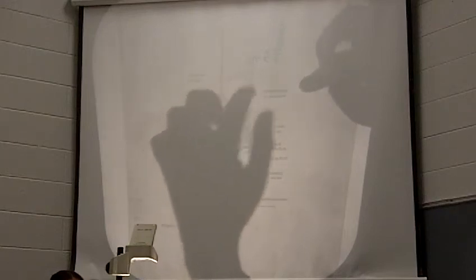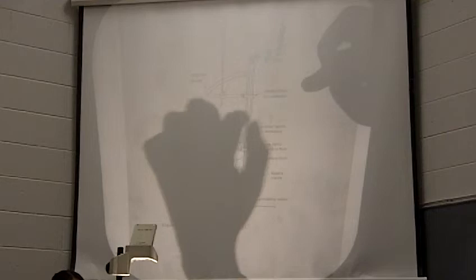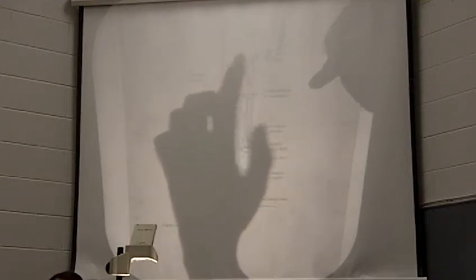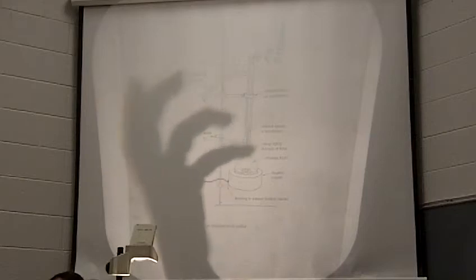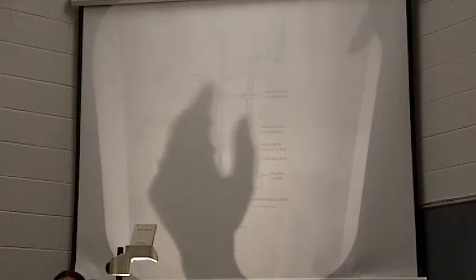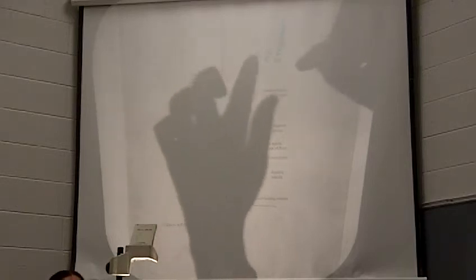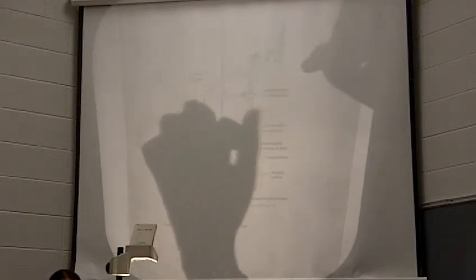Then we're going to put our condenser on top here. And usually you want to use your Liebig condenser because you've got the best cooling with that. It's got the biggest jacket on it. So you're going to have the most water circulating through. You're going to have the best cooling with it, okay? So you put your Liebig condenser on here.